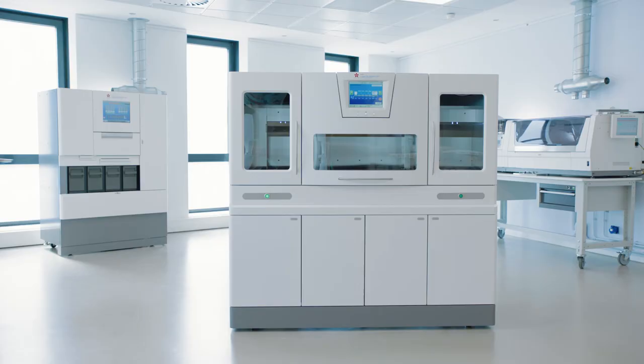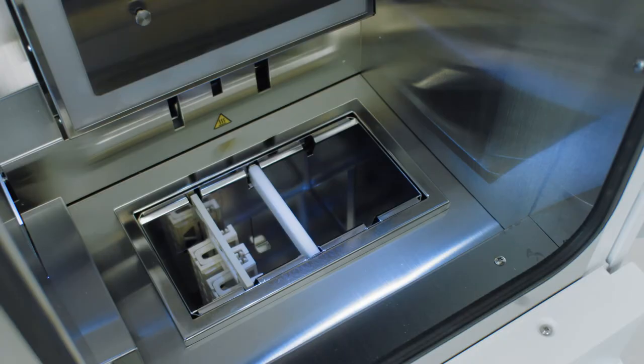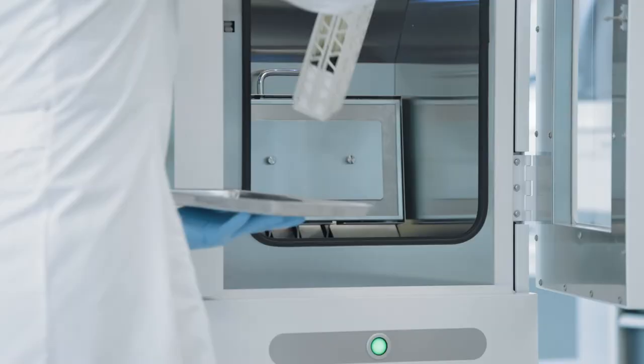We now have the confidence of excellent processed tissue, ready for embedding in a fraction of the time.